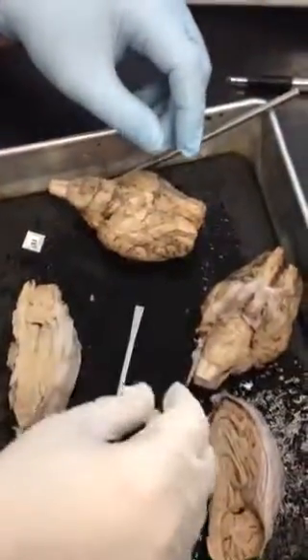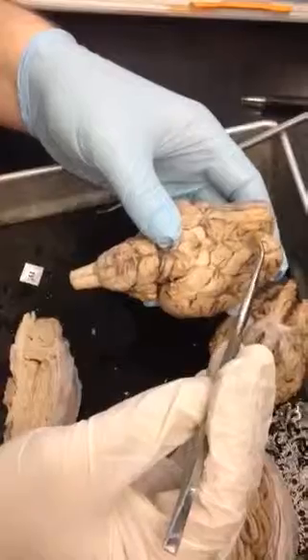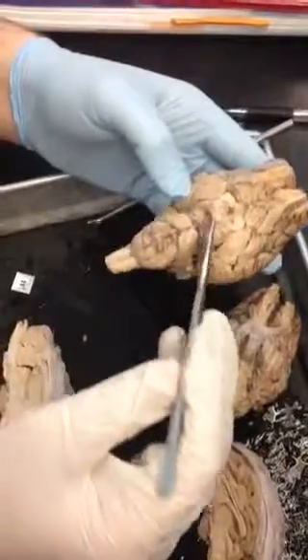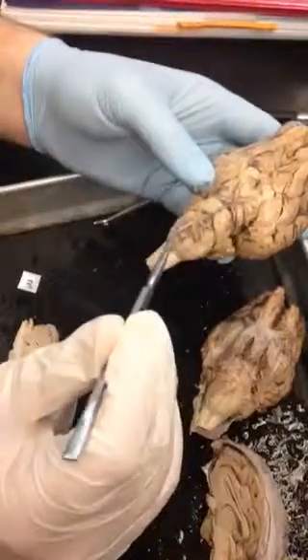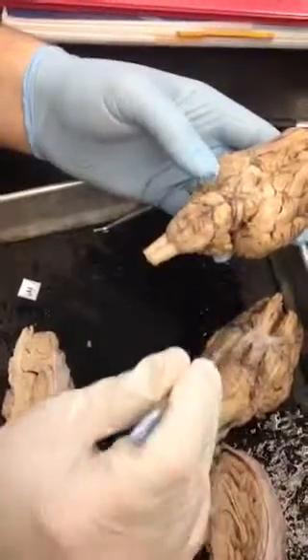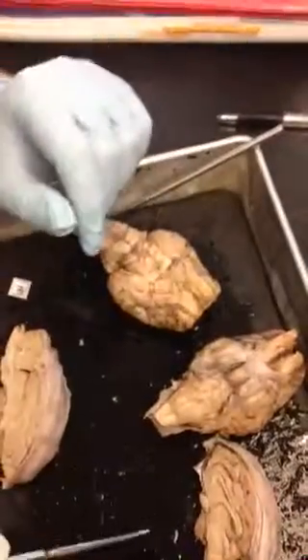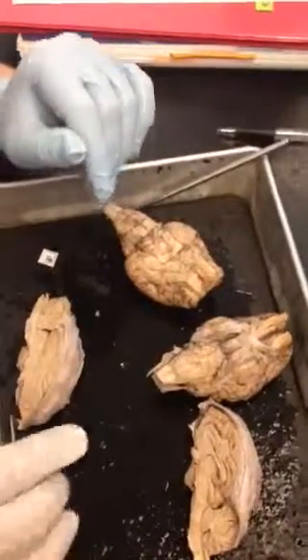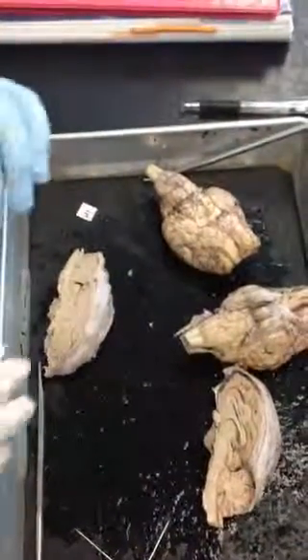Can you go through the nerves real quick, one more time? Number 1, olfactory. Number 2, optic. Number 3, oculomotor. Number 6, abducens. Number 5, trigeminal. And coming off the side is the trochlear. I think that's all the parts that you have to be able to identify, but also know the functions of each of those. We talked about a couple of them, but you need to know the functions of all of them.